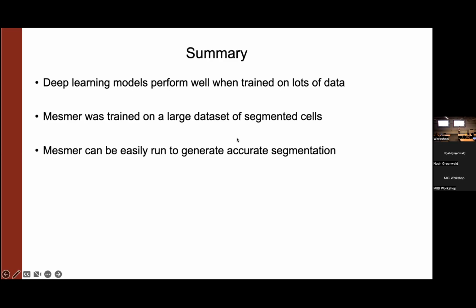If you have 5 cells all touching each other and the marker is only at the membrane, it's going to look like a honeycomb pattern, and that's very interpretable. If you have 5 cells all touching each other and it's a cytoplasm marker, then it's just going to look like everything that's not the nucleus is positive for that. And so then it's less clear where the boundaries between those cells should be drawn.